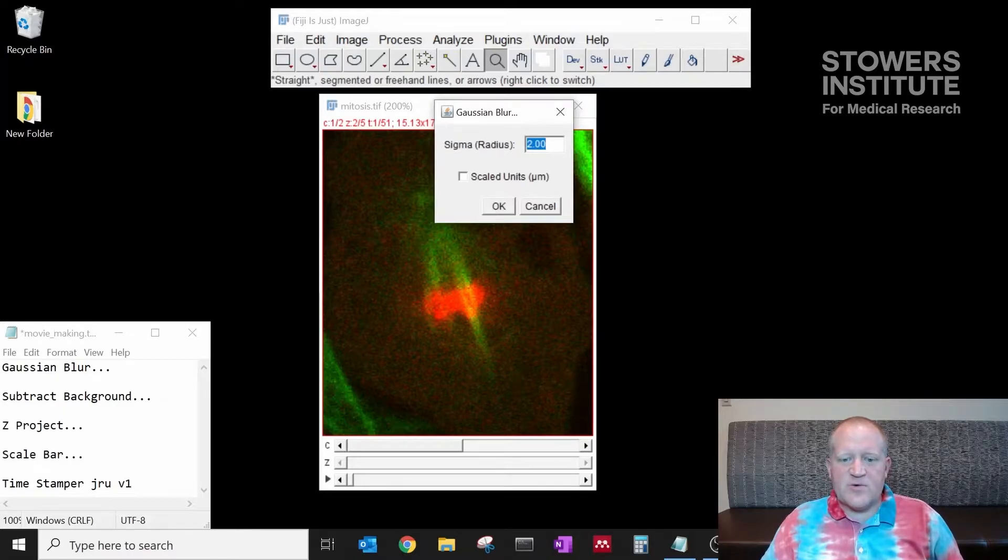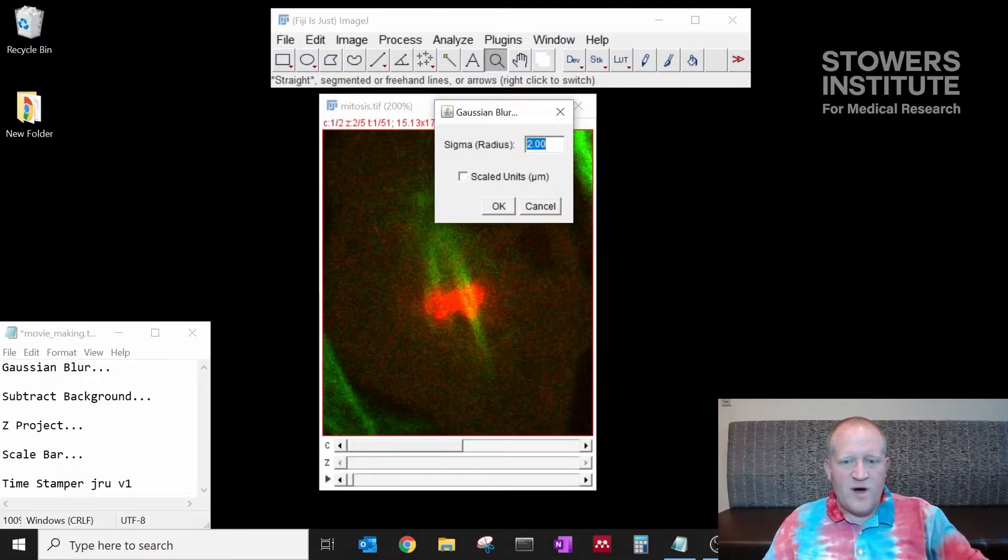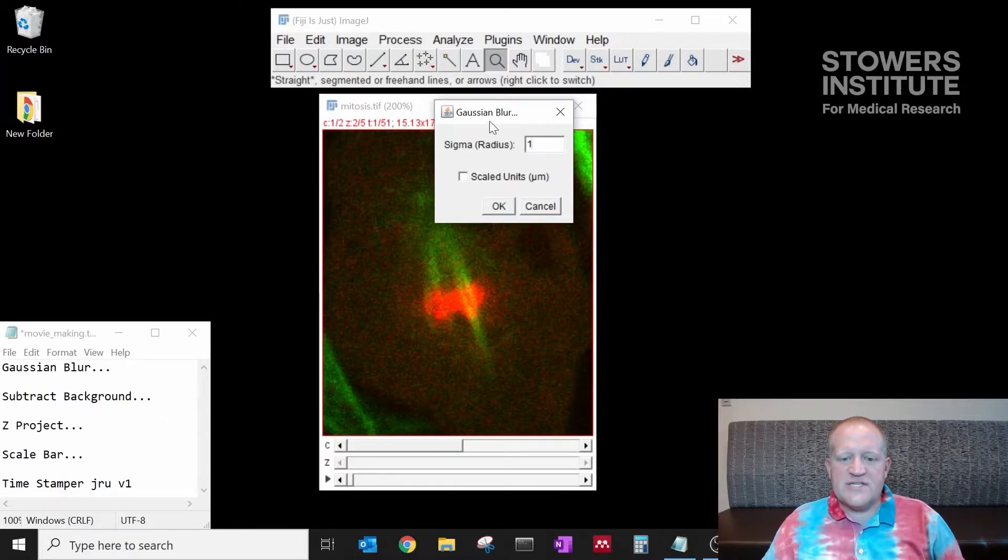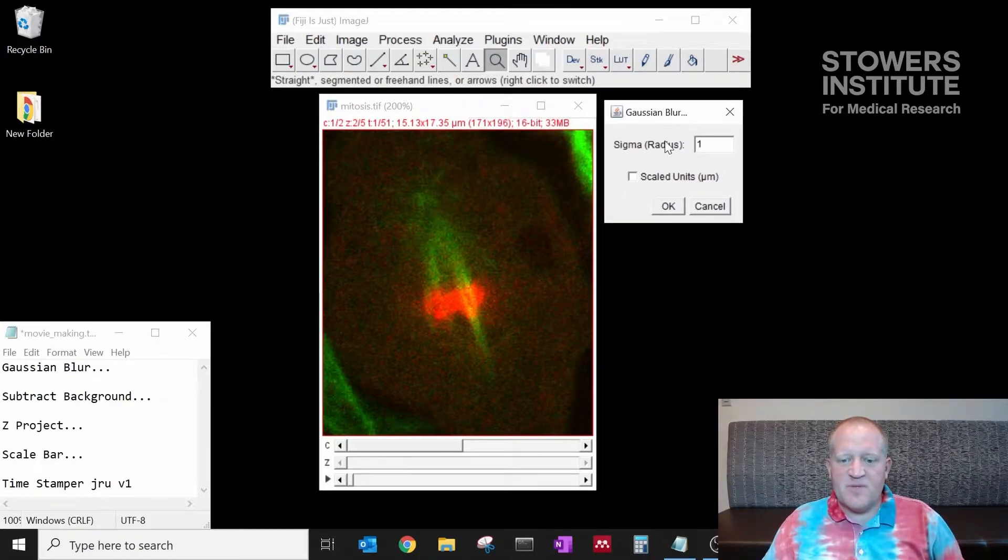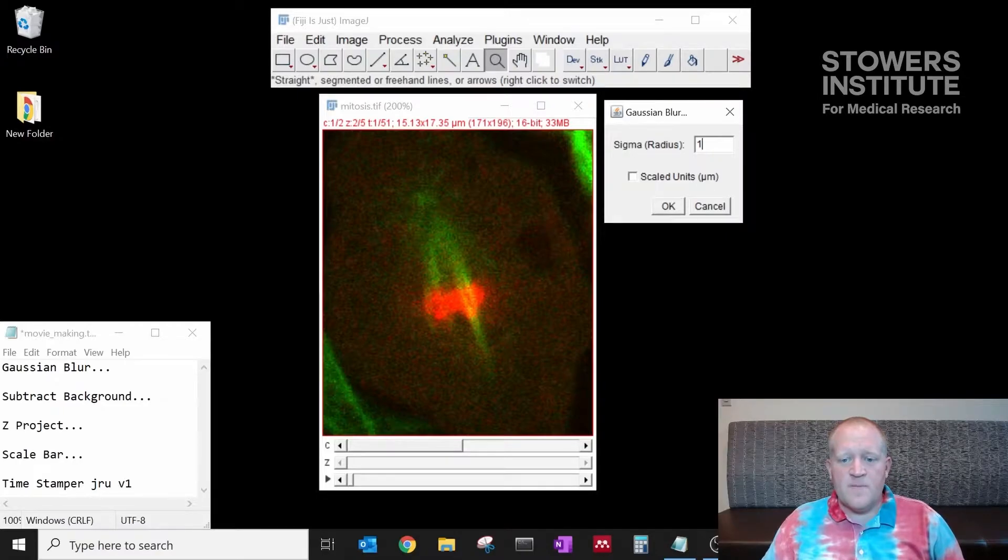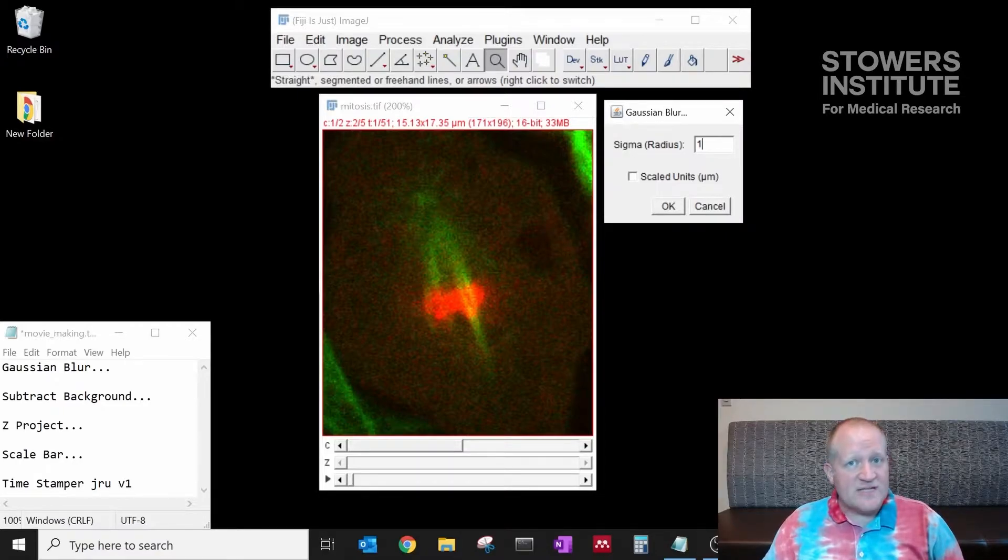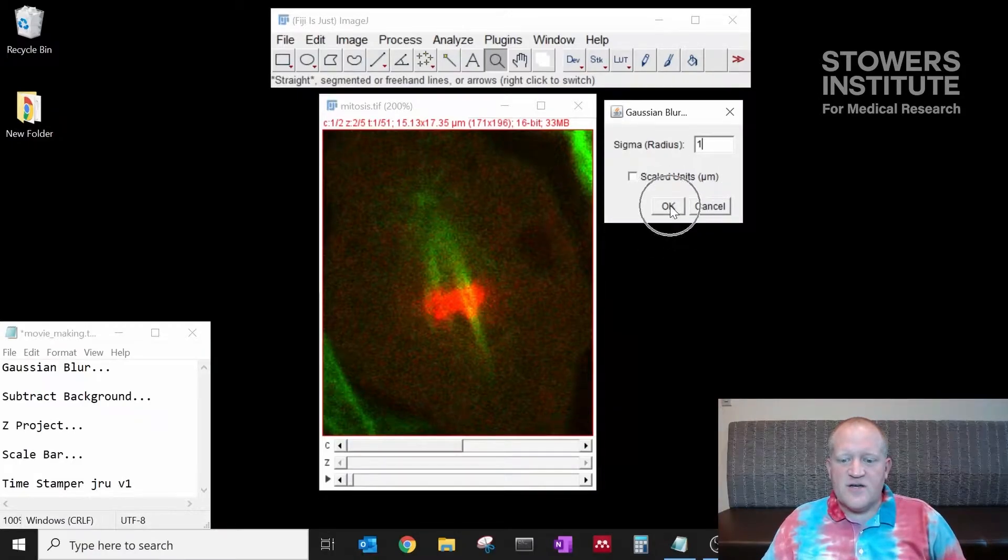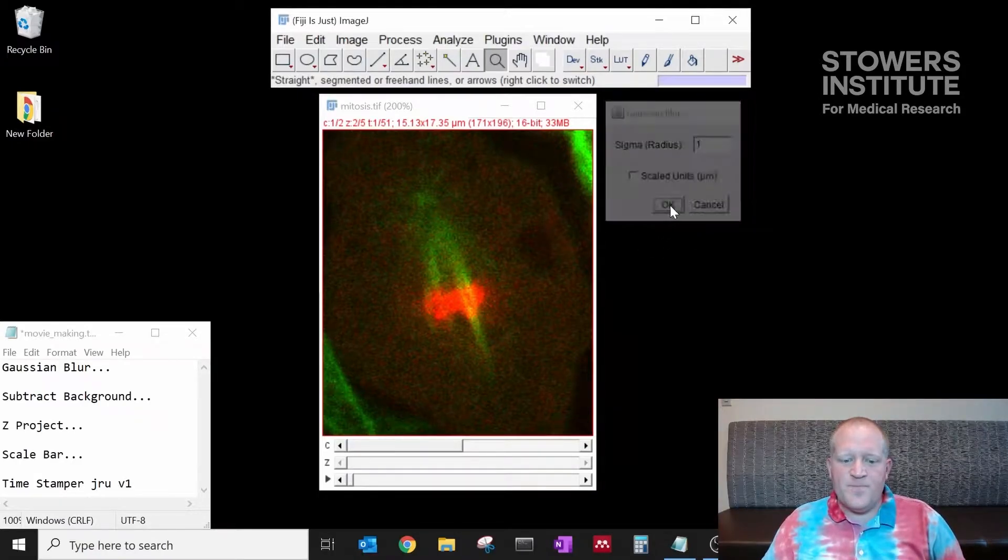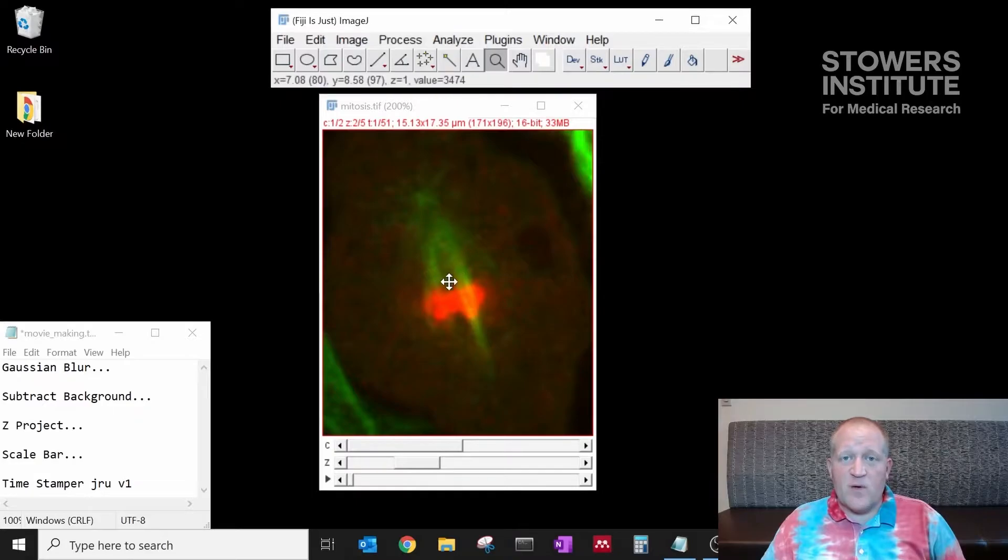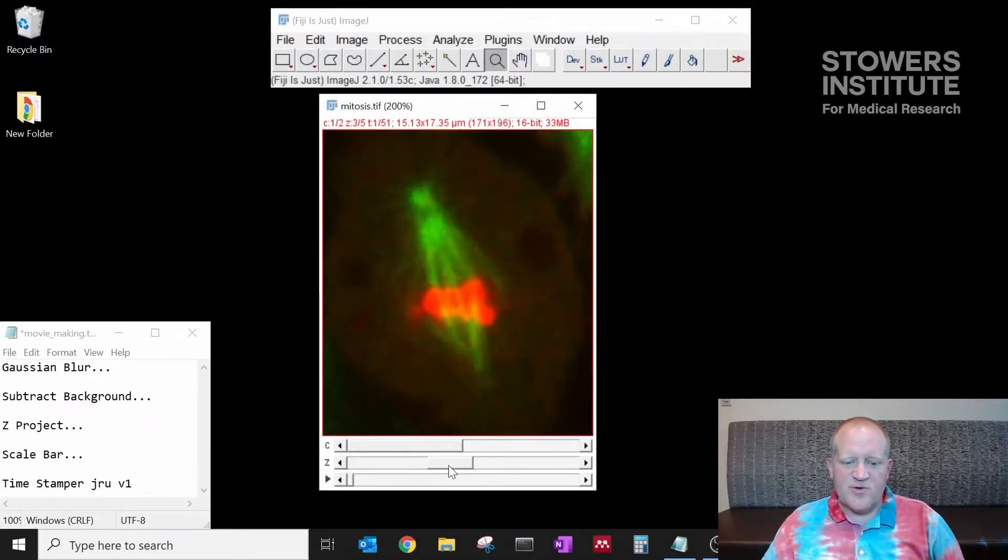The radius that we're going to use here for our data is a radius of one. You can do this in scaled units but make sure that you pay attention that the scaled units are in microns. We're going to blur with a radius of one pixel, a very slight blur. If I click okay now our data gets blurred by one pixel so it's smoothed just a little bit.